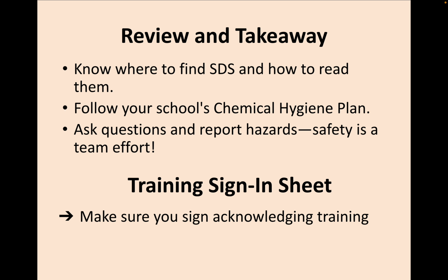All right, so to wrap up, always know where your SDSs are and actually read them, especially those key sections. Follow your school's CHP and don't hesitate to ask questions or speak up about potential hazards. Your safety matters, and you're setting an example for your students every day.